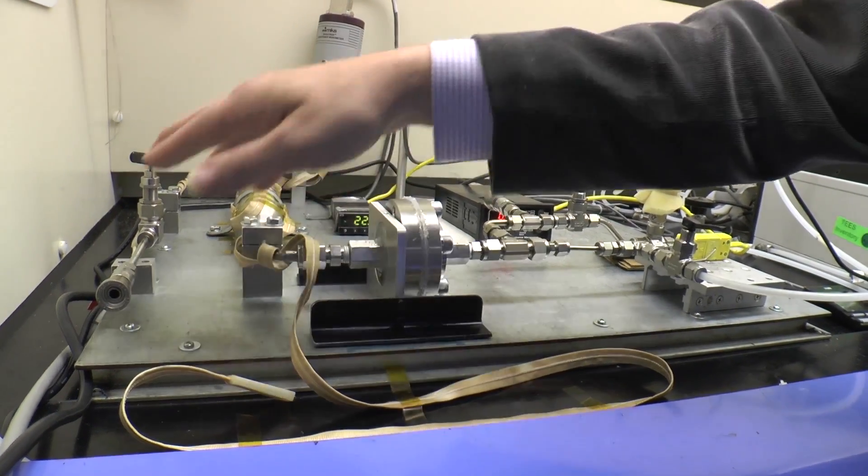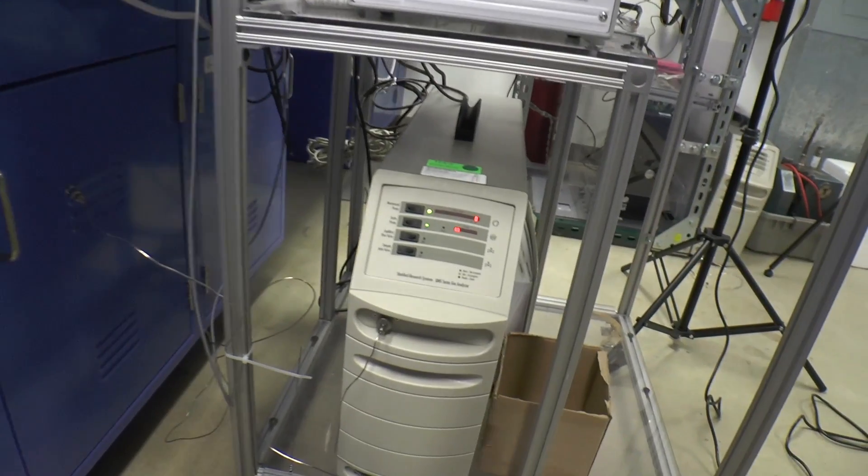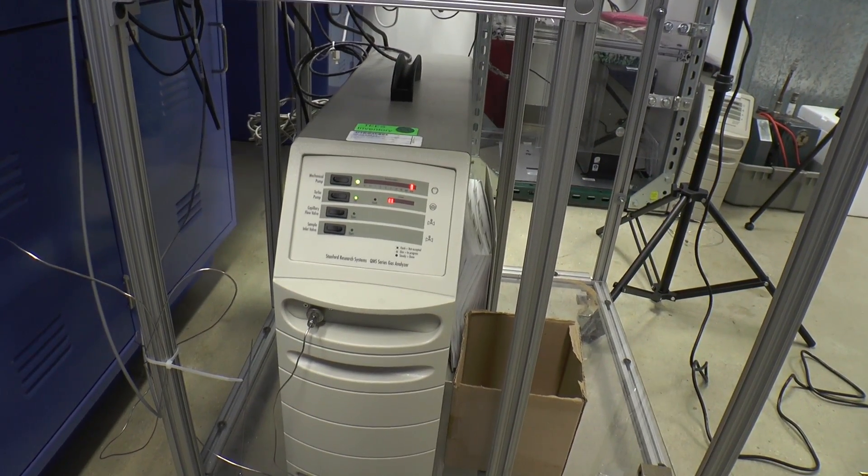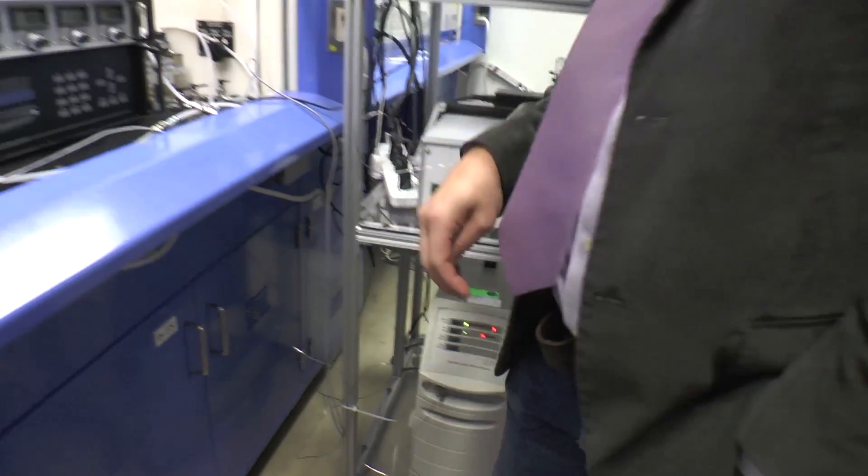And then we can, using this port, connect this to our vacuum gas sensor tucked away in the corner here, which will also give us the compositional reading so we can back out, out of that total gas permeation, how much of that is hydrogen versus nitrogen.